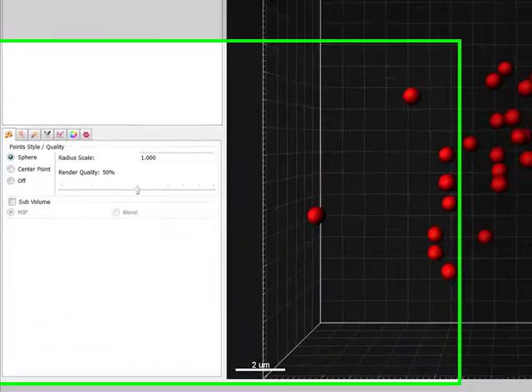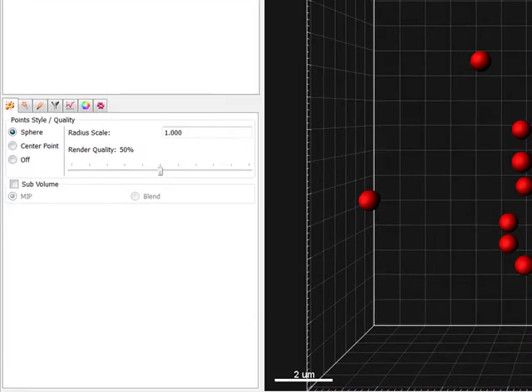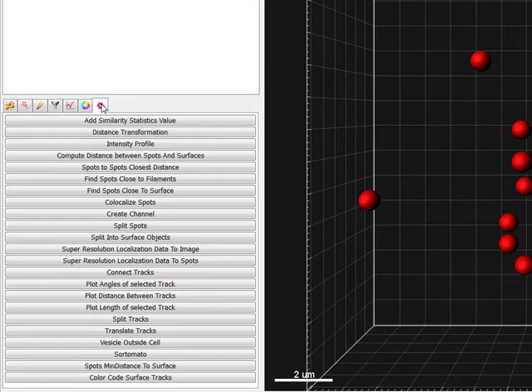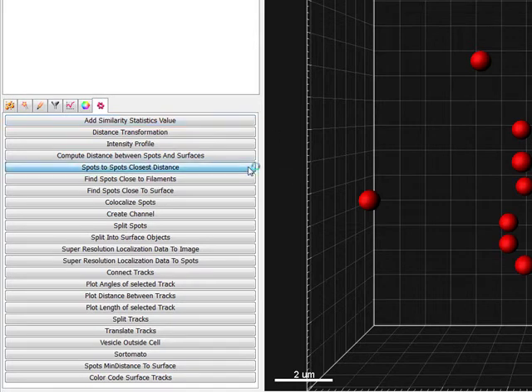All the available extensions for Spots are listed under the Tool tab. As soon as you click on the Spots Closest Distance button, a MATLAB window opens.